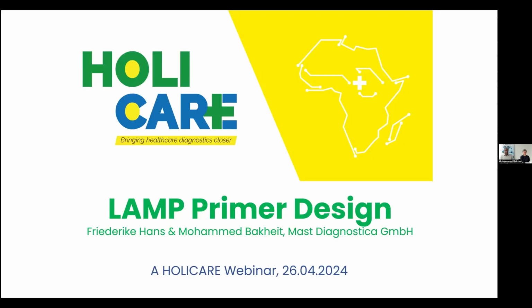The presentation will be divided into three parts. The first part would be a small introduction on the LAMP technology, very brief, and then there will be the most important part, which is about how to select sequences and define a target.